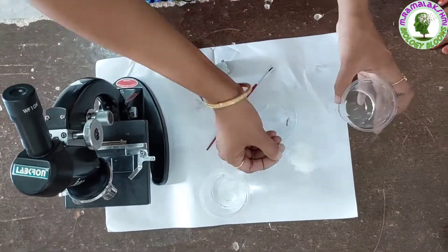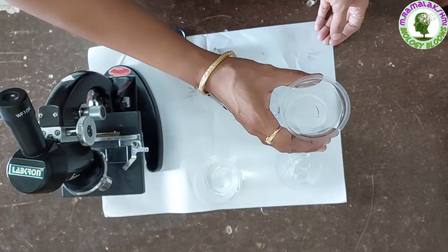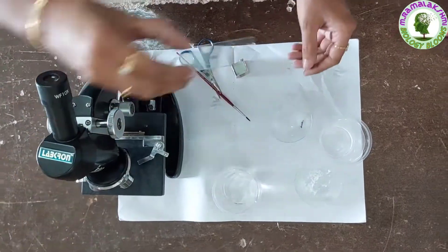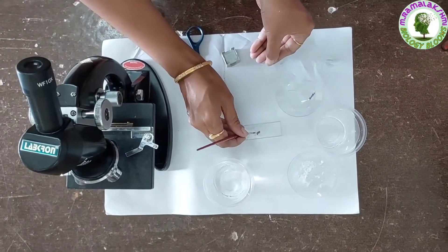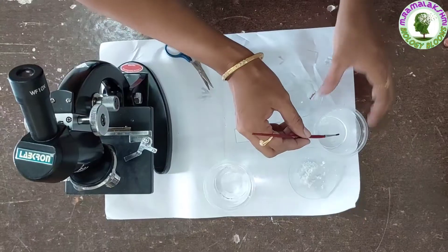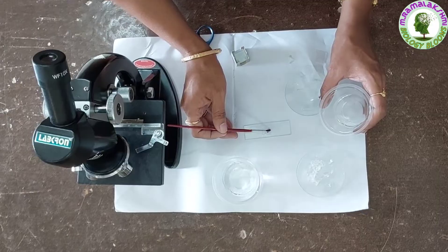Now prepare a dilute salt solution. Take out the slide from under the microscope and remove the cover slip. Now put 1-2 drops of dilute salt solution on the leaf peel and leave it for a few minutes.